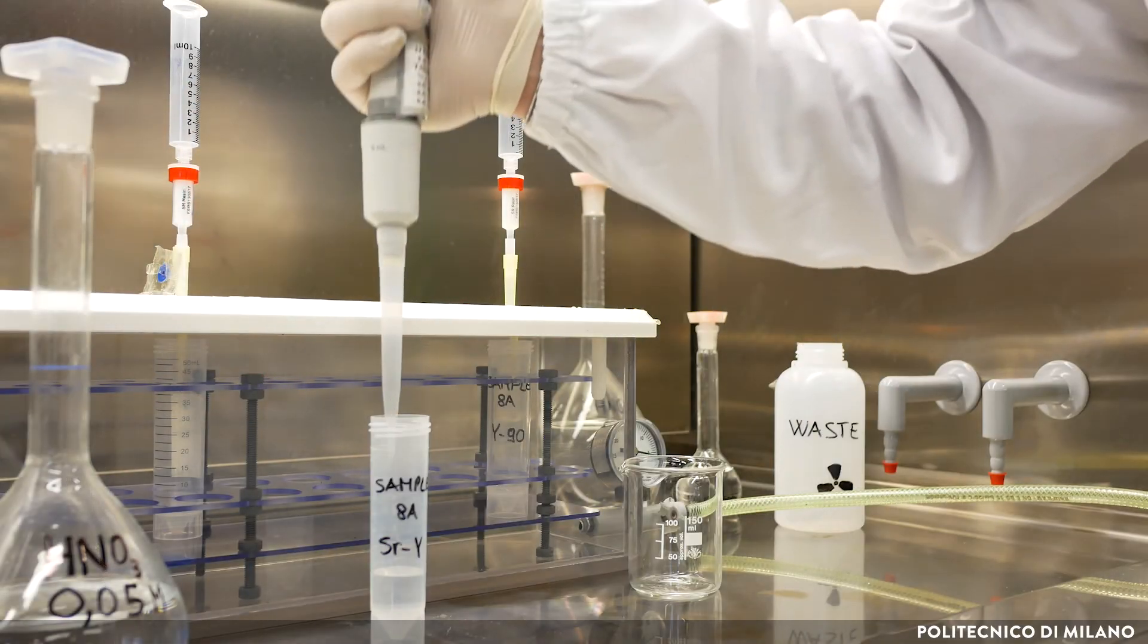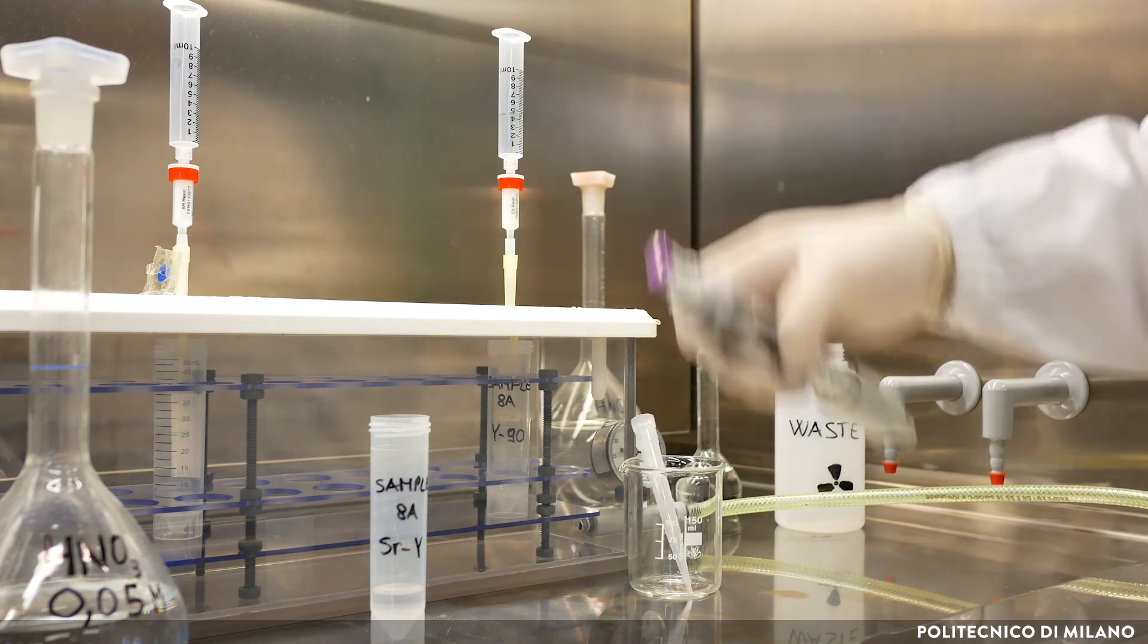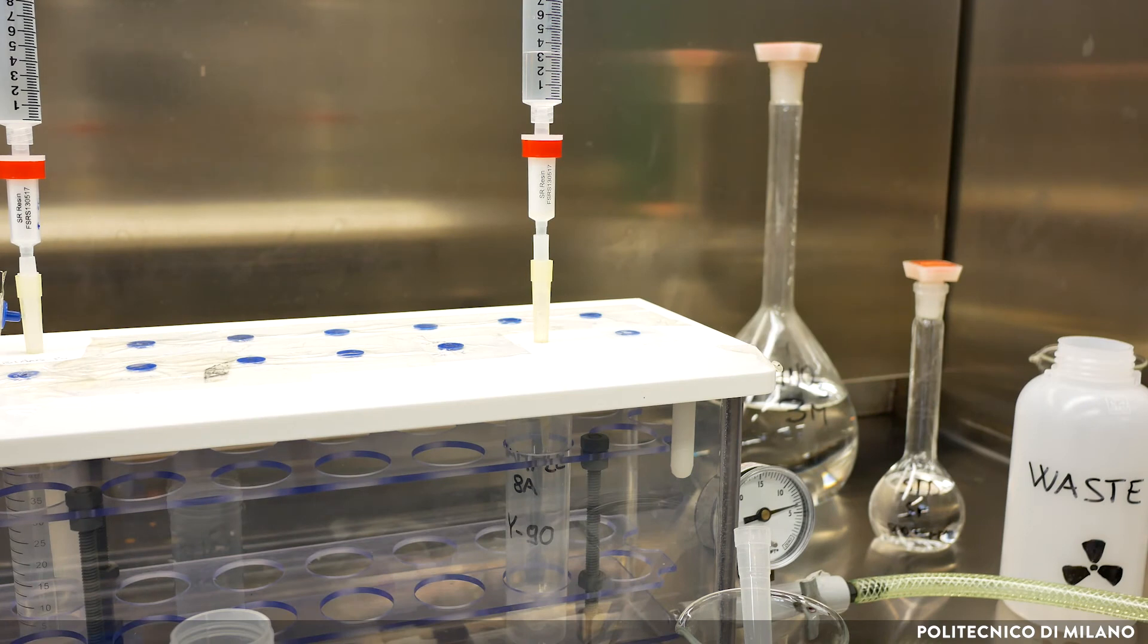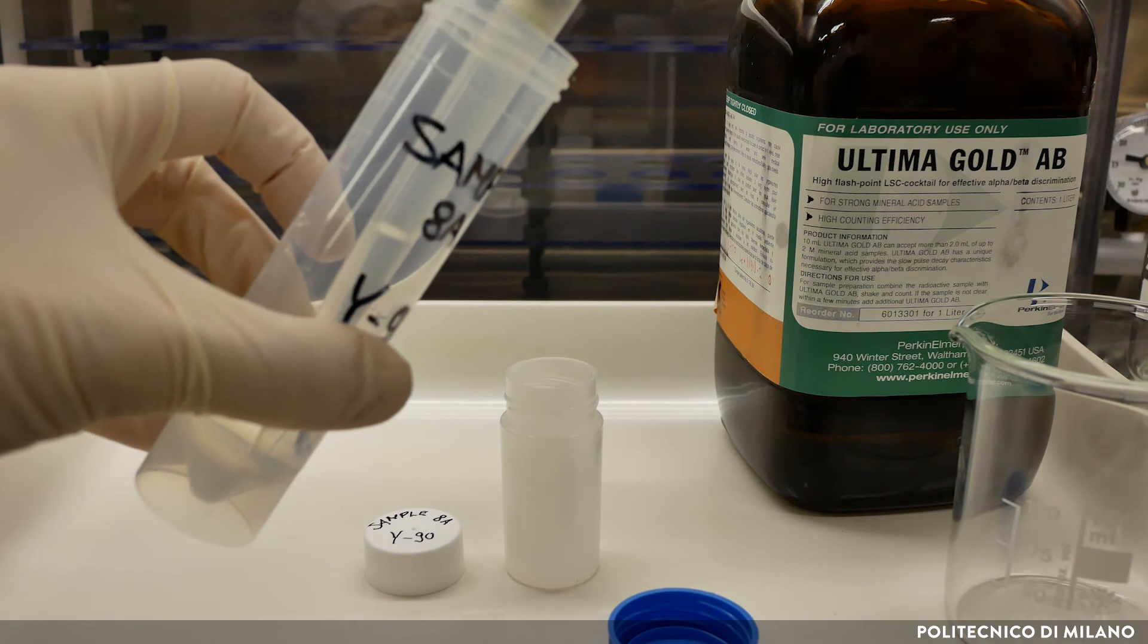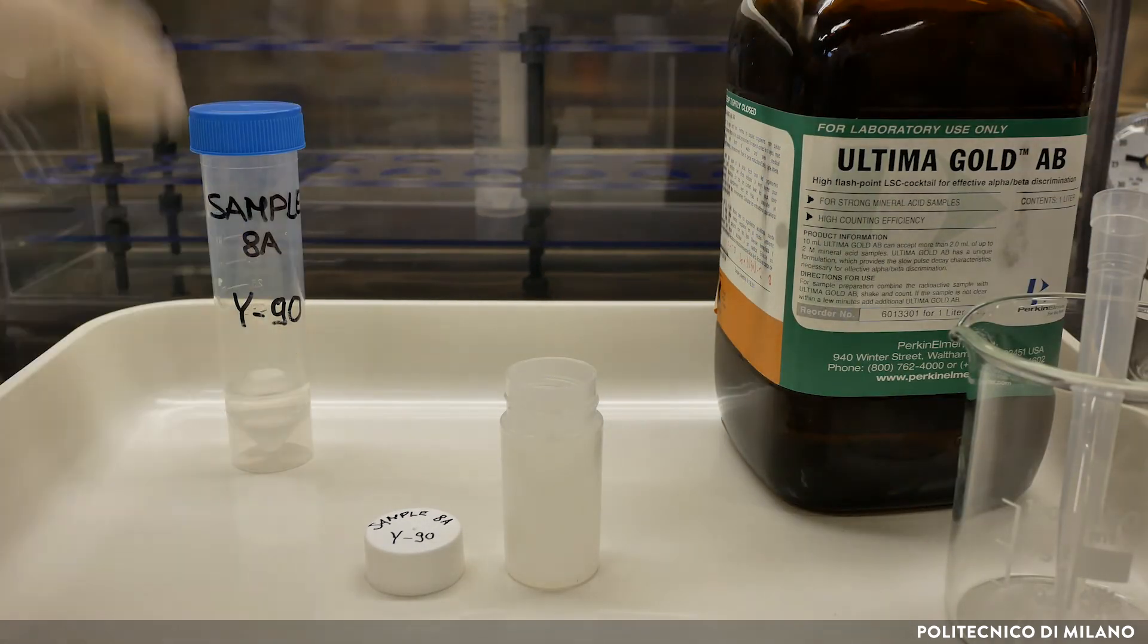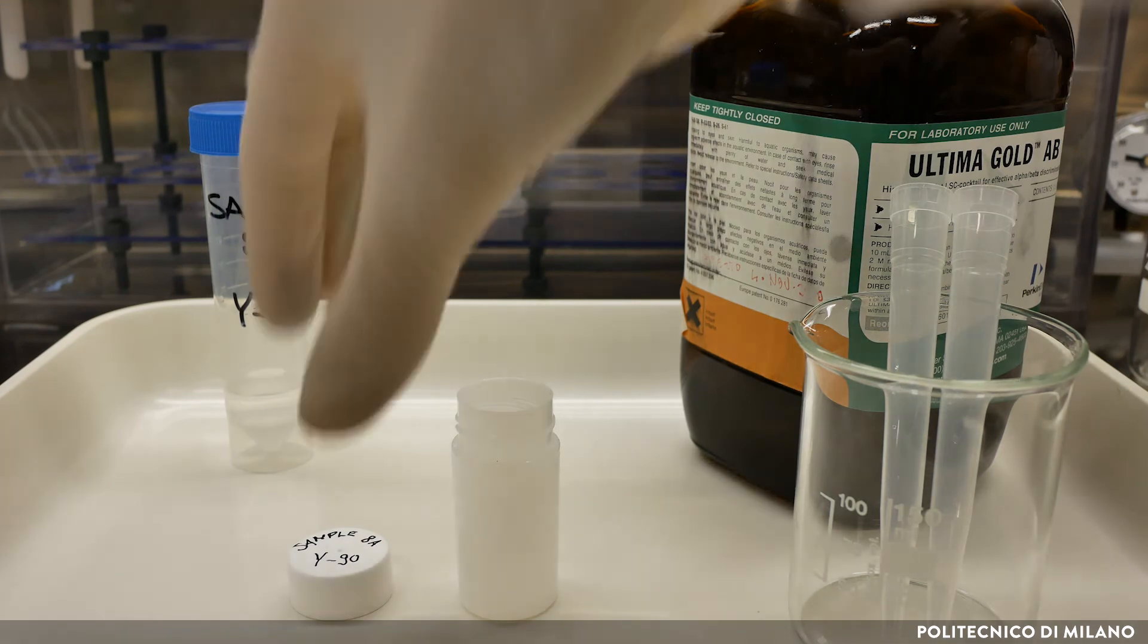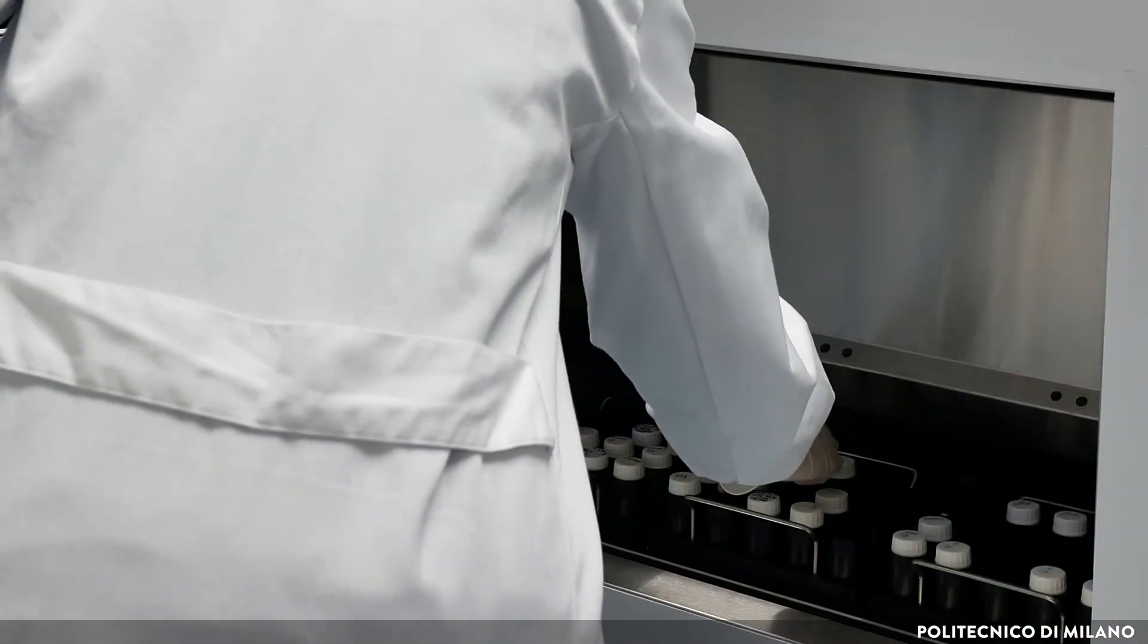The sample solution containing strontium and yttrium at equilibrium is loaded on the regenerated column, and yttrium-90 is recovered and prepared for LSC counting. The activities of beta-emitting radionuclides can be determined by gas ionization counters, proportional counters, or liquid scintillation counters. In the case of liquid scintillation counting, a scintillation cocktail is added to the sample solution, and the vial is measured in a liquid scintillation counter for a sufficient time to achieve the desired counting statistics.